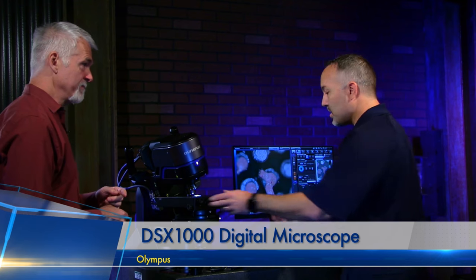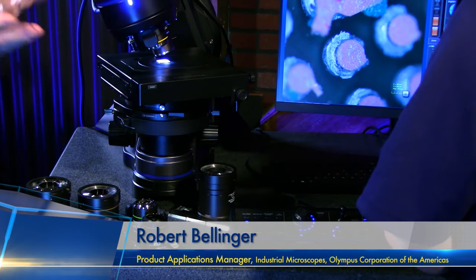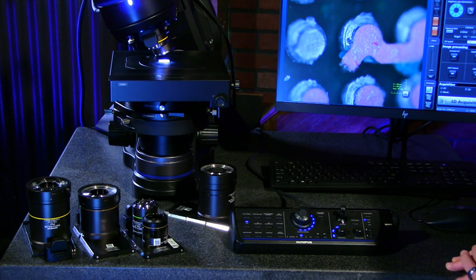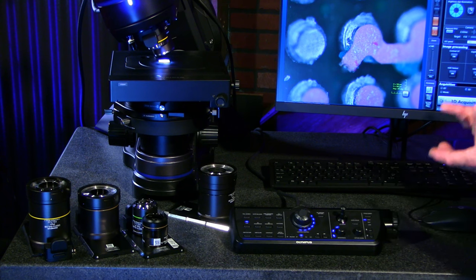That's an important fact that it's a centered rotatable stage. That allows you to be anywhere in your XY drive of the stage and rotate around the center of the optical axis, rather than around just the center of the stage. On other systems, you'd have to put your part right in the middle of the stage travel, and if you wanted to look at a different area you'd have to physically center that feature over the center of the stage. This one has the stage centered to the optical path, so no matter where the stage moves, it's centered in the optical path and rotates right around the optics. It's all integrated with no cables hanging off, and allows you to rotate around. The tilting feature allows you to get all those different angled views and still rotate and see different angles.